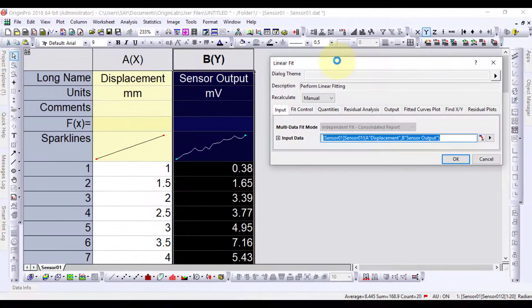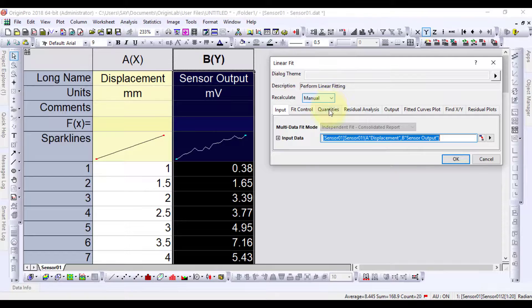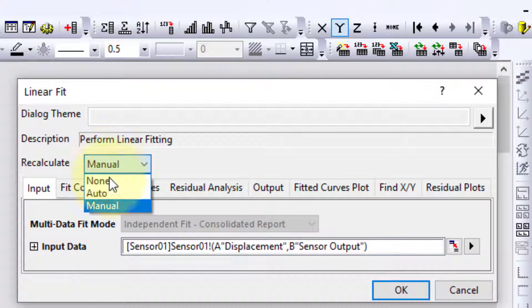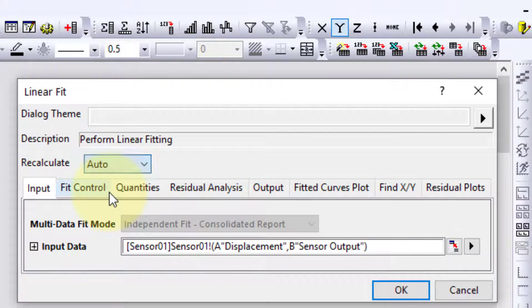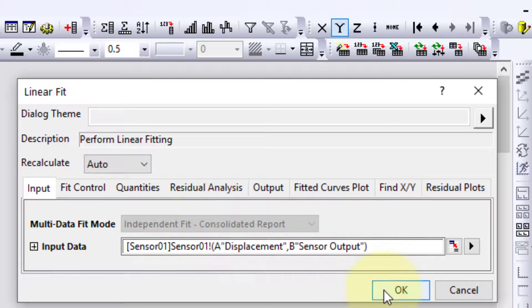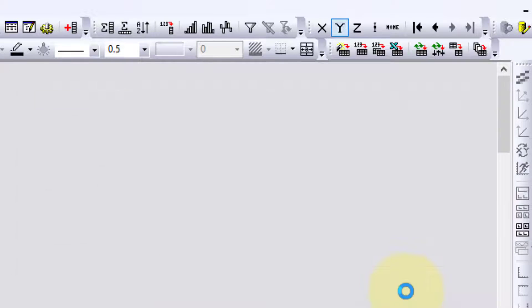From the prompted menu, change the recalculate to auto and click OK.